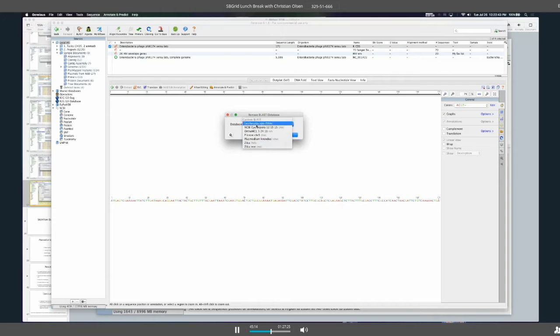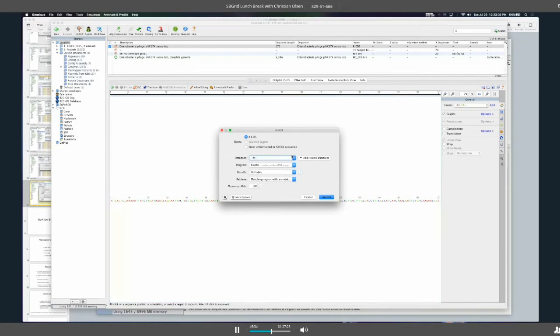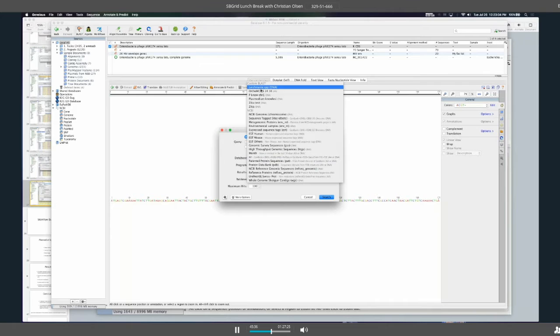So to remove a custom BLAST database, then you can just select, in this case, I'll select the NCBI Cyclospora data that I have because it's old, and I'll click on the OK button. Geneious will give you a second chance. Are you sure you want to do this? You say yes, delete database, and now it's gone. Okay, and I know it's gone because when I go to look at my database selection, it's not found here in this custom BLAST list.